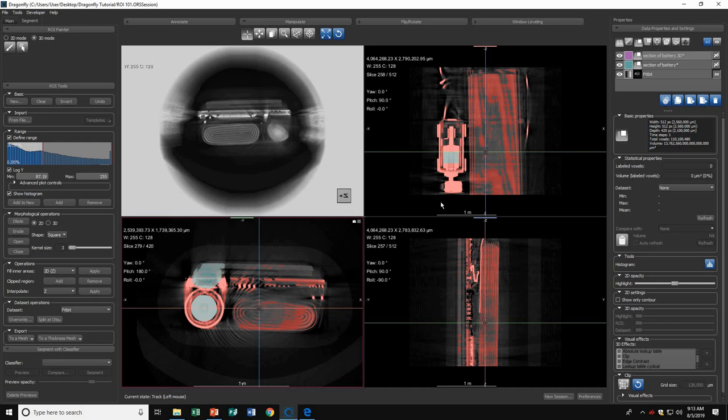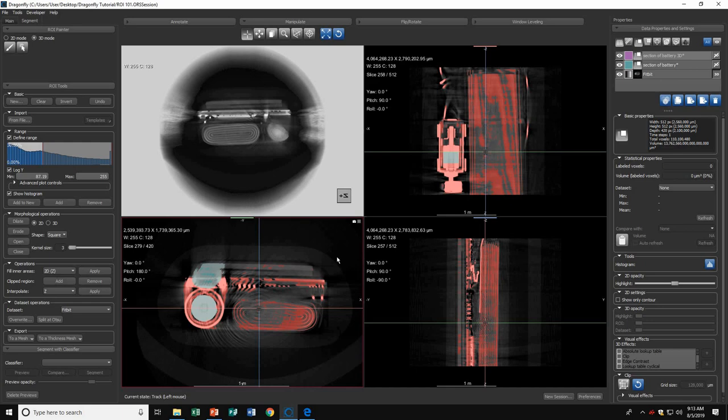In 3D mode, when you paint a region on your selected slice, Dragonfly will continue to paint that same exact region in multiple slices on the same axis. I'll show you what I mean. First, I'll hide this for now.